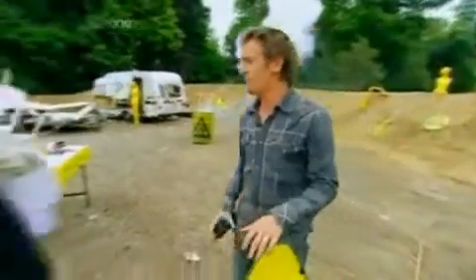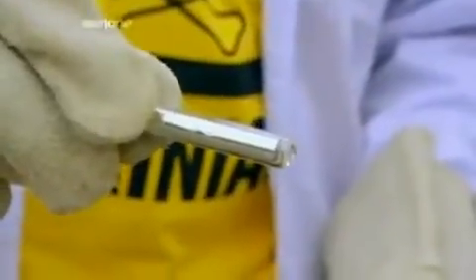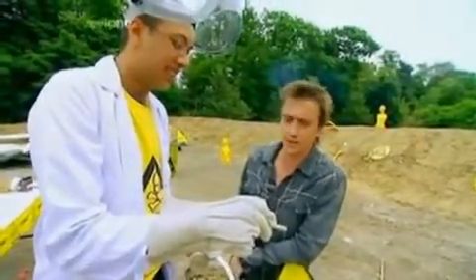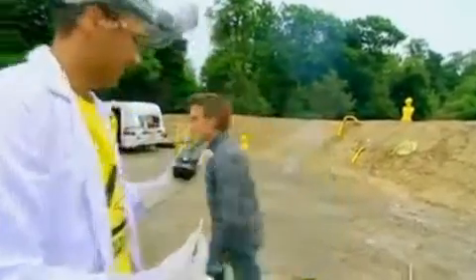Mr. Tickle, bring on the rubidium. Here it is. Is that it? Well, it might not look like much, Richard, but it's a highly reactive metal. It's sealed in this glass tube under argon atmosphere conditions, just for safety. Right, so what's going to happen when you drop that in the water? Well, imagine, if you will, letting off a hand grenade in a bathtub. Righto, I'm off. Have that. OK. Good luck.